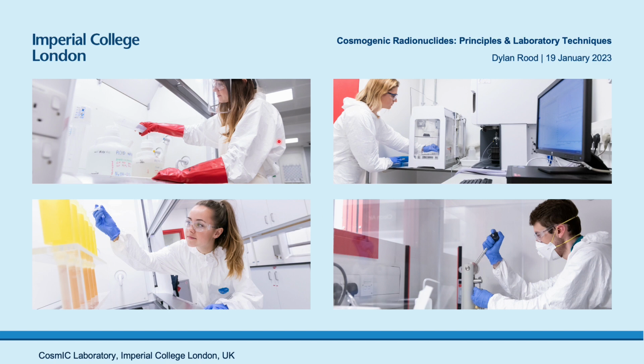And so to show you a few more pictures of what the lab work actually looks like, this is again showing that quartz purification step. We're working with hydrofluoric acid, with the whole PPE set up, in plastic fume hoods capable of working with hydrofluoric and perchloric acids.